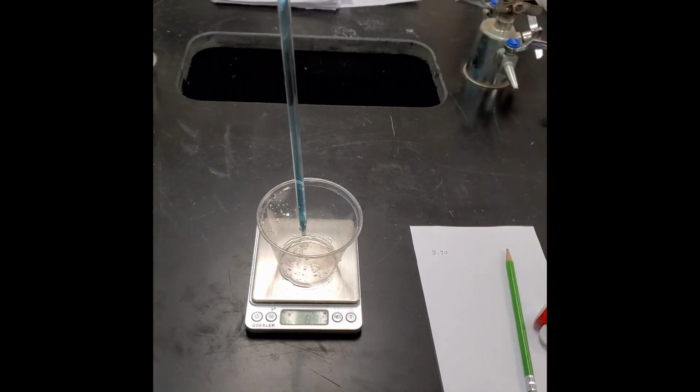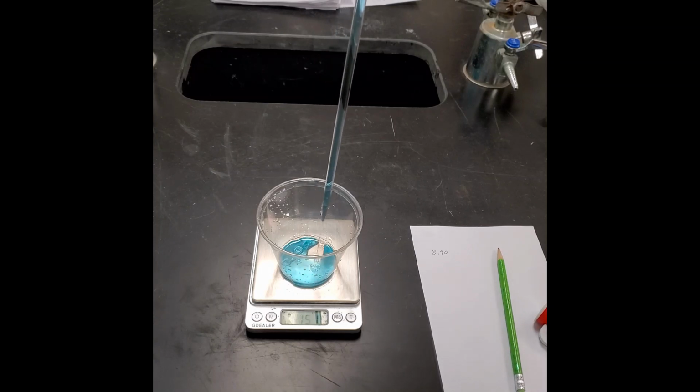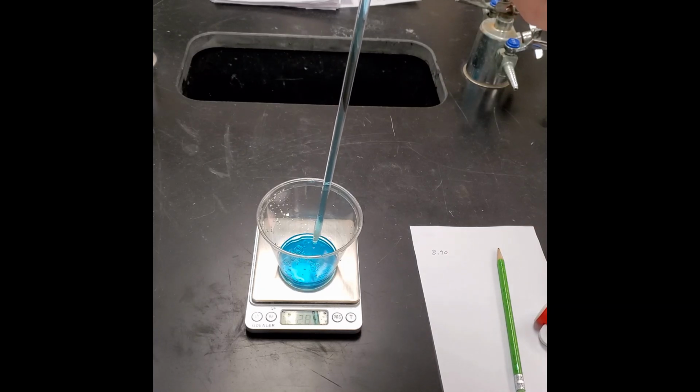Then you're going to hold this over the cup and just lift your finger off, and let it gravity drain. As it's draining, obviously the mass is going to increase, but you are delivering exactly 25 milliliters. So at the point in the lab where you have to get the density, we're getting the mass right here with the balance. The volume is always 25 milliliters, okay? And so when you divide to get your density, it's going to be the mass that you calculate by subtracting out the cup, divided by 25 milliliters.